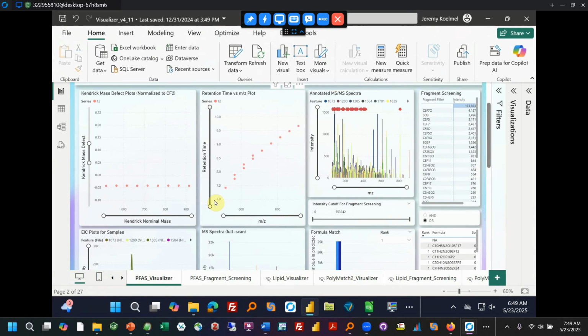This is an exceptionally nice data set as far as the complexity of the PFAS within the data. So if you have blood or something, you might only have one or two series and they might be pretty sparse. This might be a much harder process, but I am giving you this example. So again, the trends are nice.